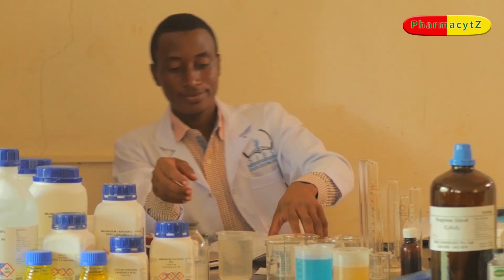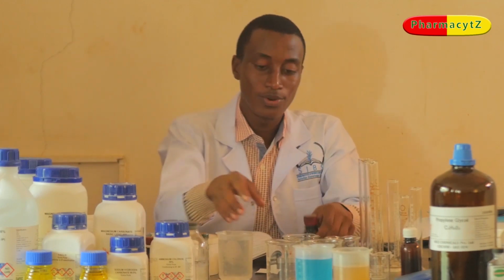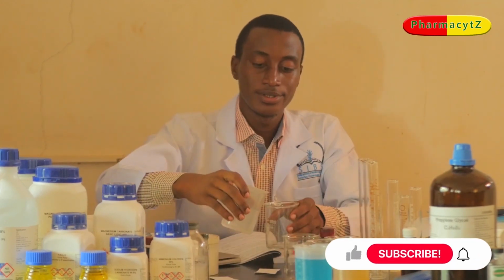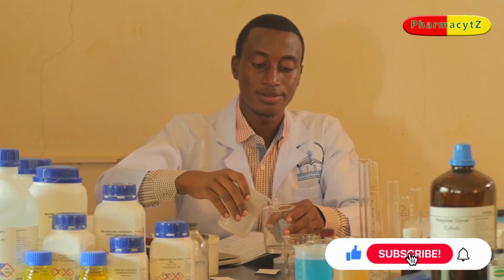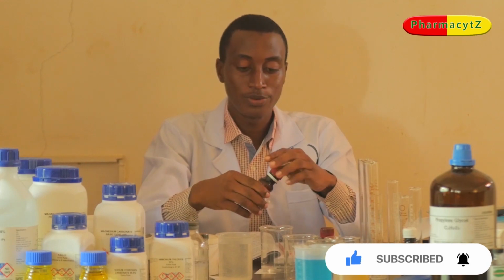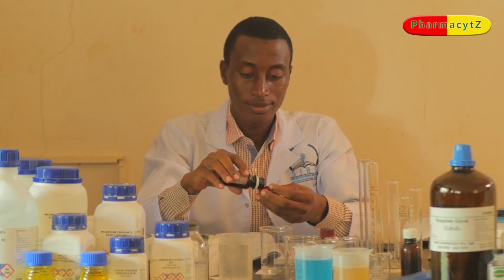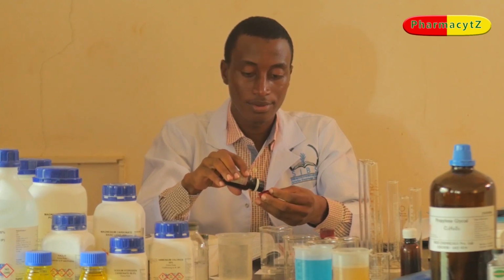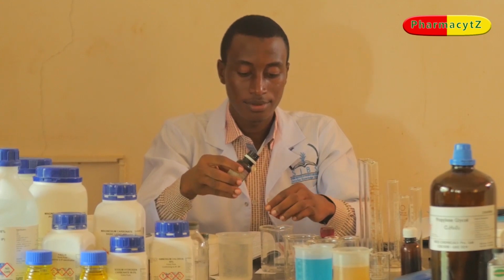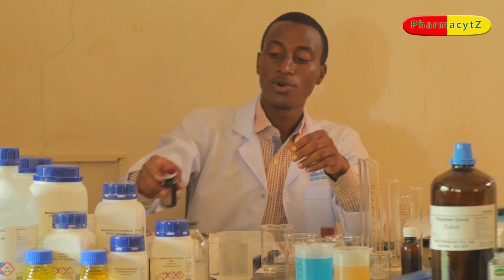Suppose I dissolve iodine crystals directly in water. See what happens. This is purified water. Now, if I put some iodine crystals directly in purified water, this is what happens. I'm going to stir.